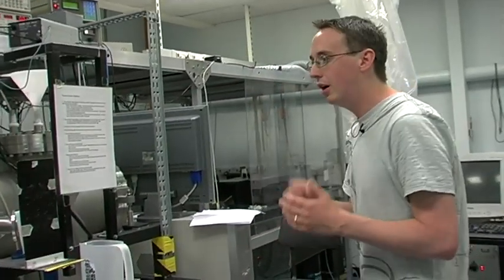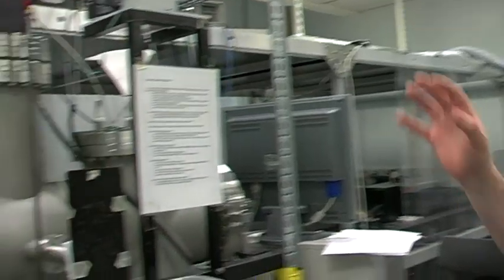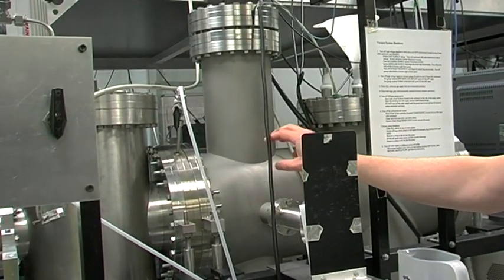Back here we've got the kit that actually does the job. Inside here is where all the action happens, and we've got a high vacuum can separated into two parts.